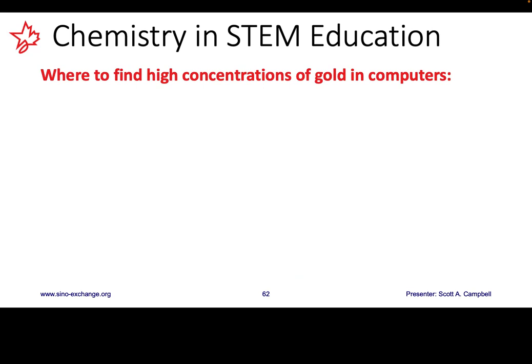Now, if you want to do an e-waste lab, the first thing you will need to do is to collect scraps that contain precious metals. For reference, older computers do tend to be better for this kind of experiment.